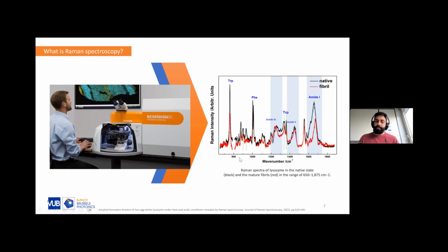Each energy shift corresponds to a change in the energy state, when the molecule gets excited to a certain energy state and then comes back. So certain structures would have certain specific shifts that would have the peak there.